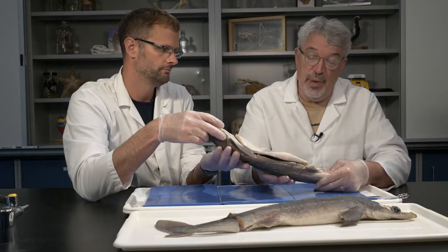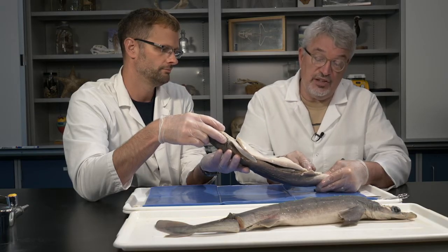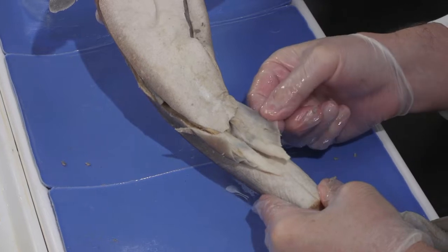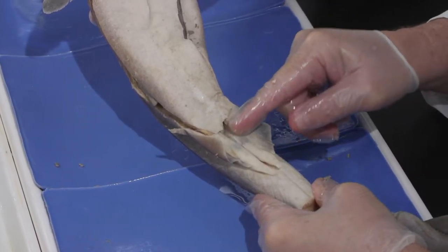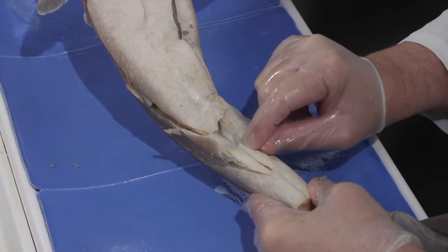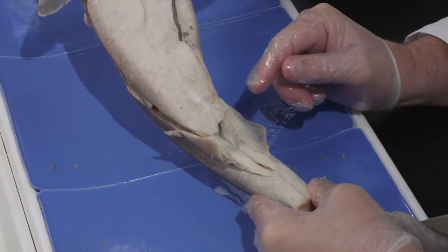We can tell this is a male shark externally because of the presence of these elongated claspers on the pelvic fins. On the inside of the pelvic fins near the cloaca are these two long structures that they use for transferring sperm during copulation.